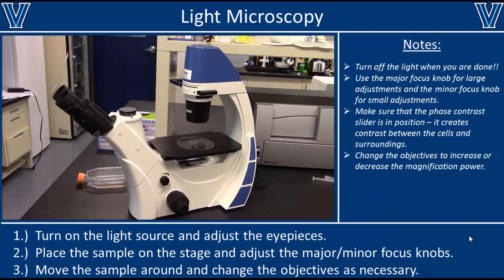This is an example of an inverted light microscope. It's called an inverted light microscope because the light comes from the top and goes through the sample to the bottom, instead of the classical setup in which the light source is beneath the specimen.